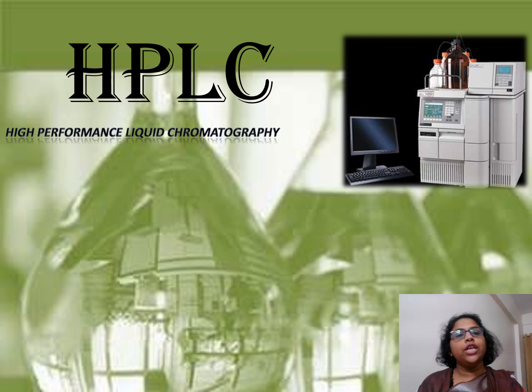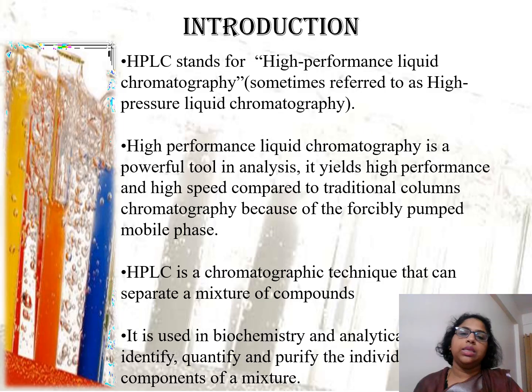Hello everyone. So today we will learn about HPLC. What is HPLC? HPLC is high performance liquid chromatography. So this is a very important tool in the analysis of many components in a mixture because it has high performance and high speed. It employs high pressure.